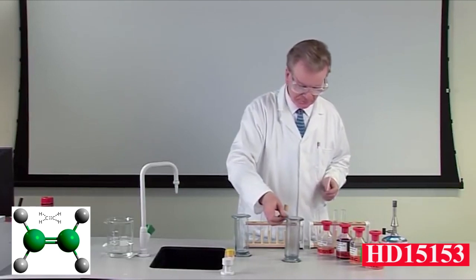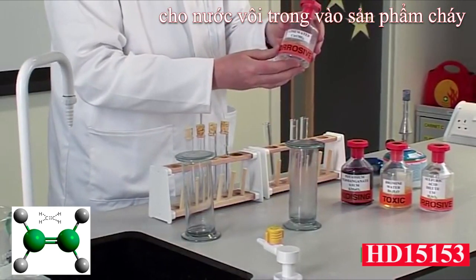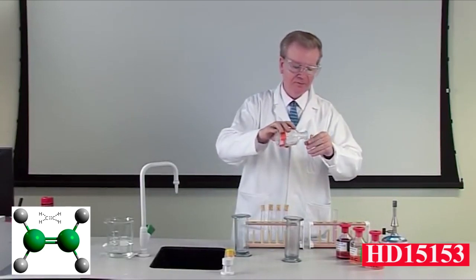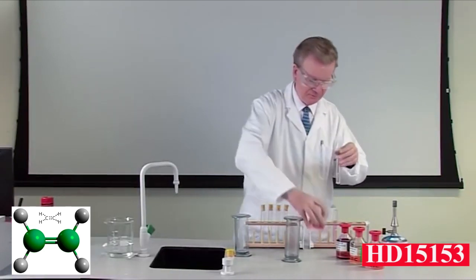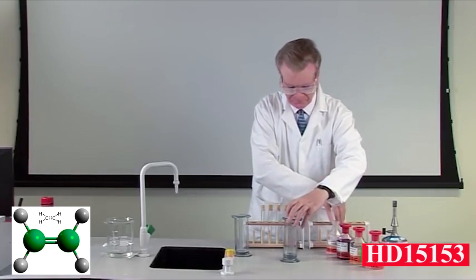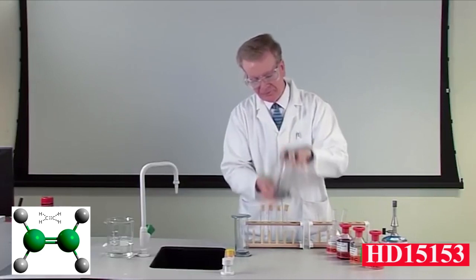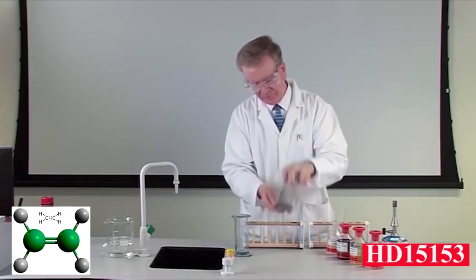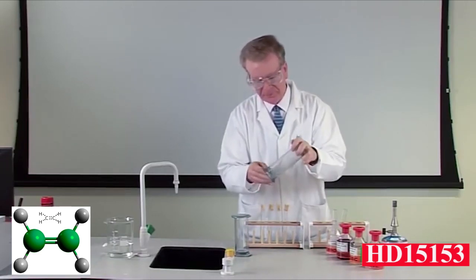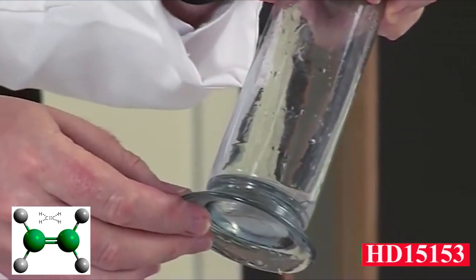When it has stopped burning, add some lime water to the gas jar. Replace the lid and shake the gas jar a few times. The lime water turns milky, showing that carbon dioxide has been formed when ethene burns in air.